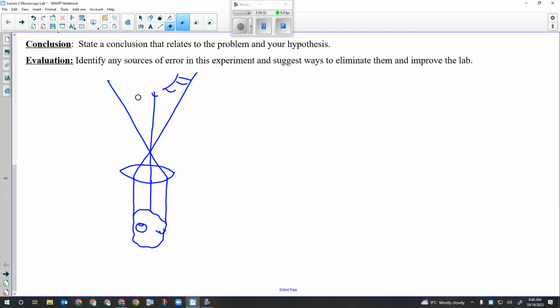Now it's going to be confusing, okay? So now, the light that came from this side of the specimen ends up over here, okay? And I get the specimen being inverted and bigger, okay? So that little circular thing that was on the left in the specimen is actually going to be on the right when I look at it, okay? Because the lens is going to flip it during the process of magnification. Everybody all right with that?